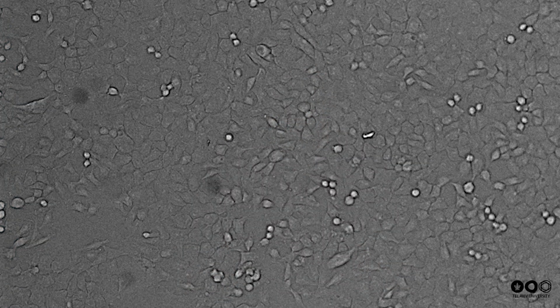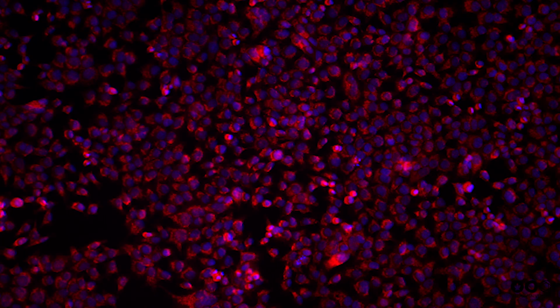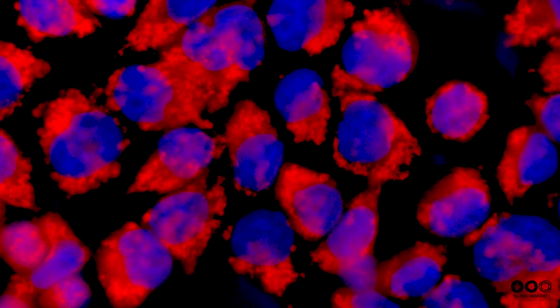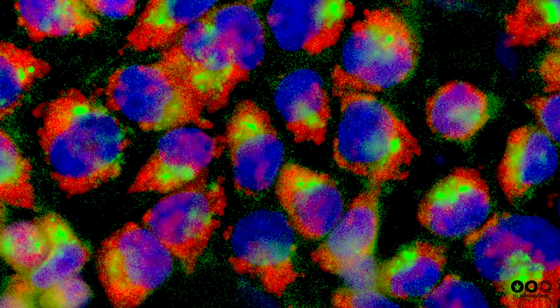Without staining, it's hard to pick out details in these HeLa cells, and you might even have trouble making out where one cell begins and another ends. Staining the nuclei blue immediately helps us identify individual cells. Surprisingly, the mitochondria, stained here in red, are far more abundant than what we might expect. Cells have loads of mitochondria dispersed throughout the cytoplasm. The Golgi apparatus, on the other hand, tends to be more localized, as is seen here in green.